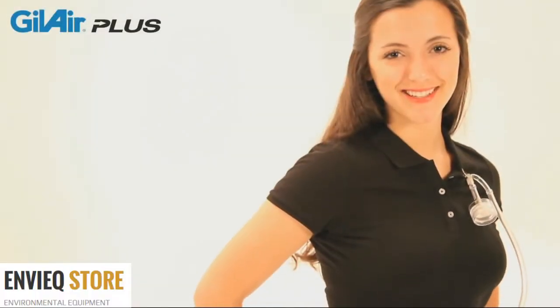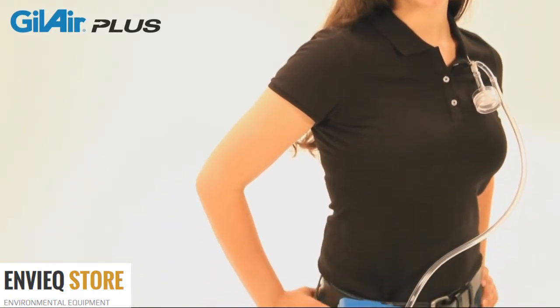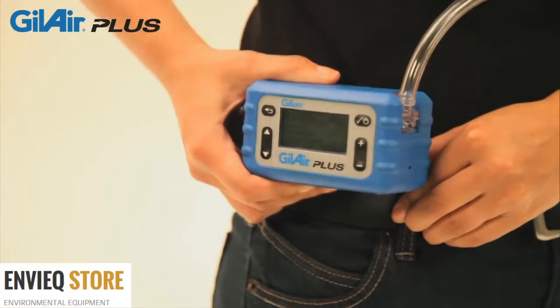The Gillian reputation for quality and reliability continues in the innovative GillAir Plus Personal Air Sampling Pump. GillAir Plus is the pump that does more.